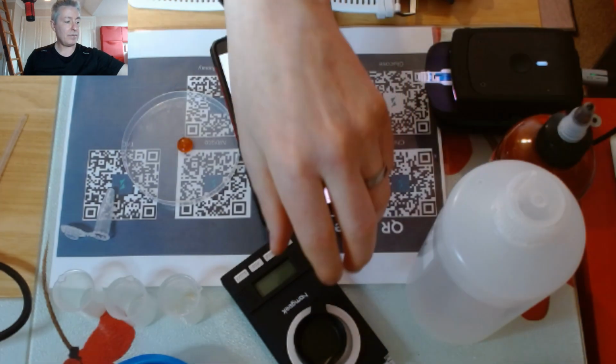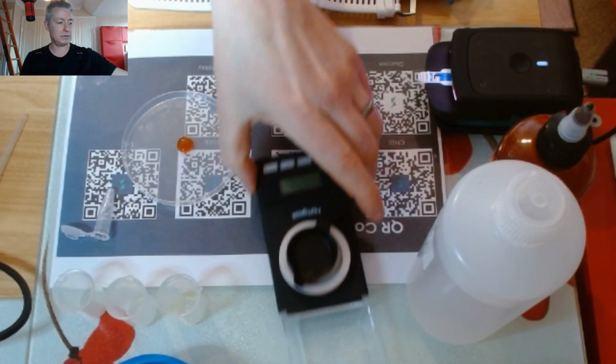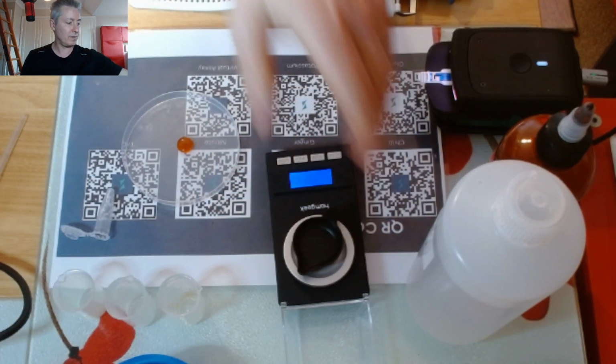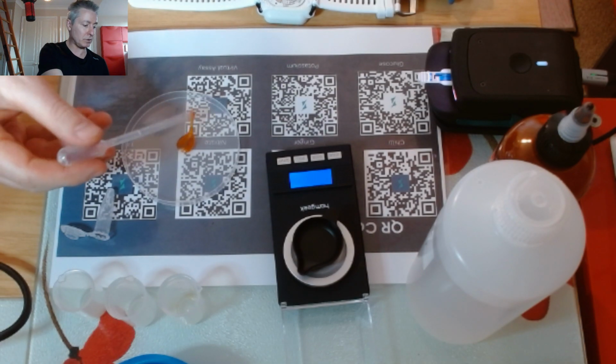I have a scale here, so I'm just going to pull the scales in quickly. I just want to weigh out 0.1 grams of material, so let me do that. I might not be super precise in doing this. I'm just going to do it fairly quickly.